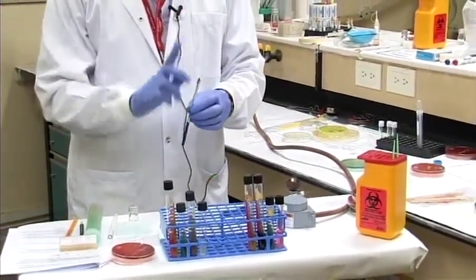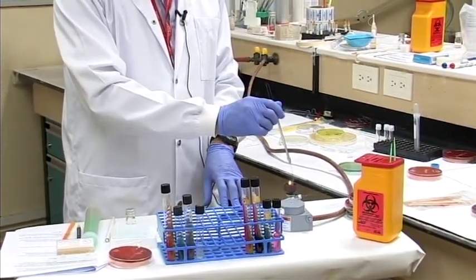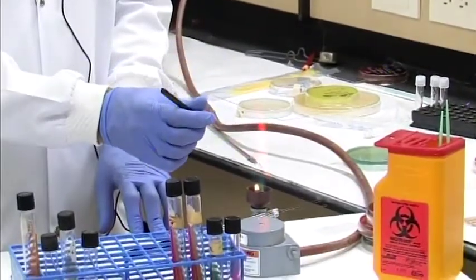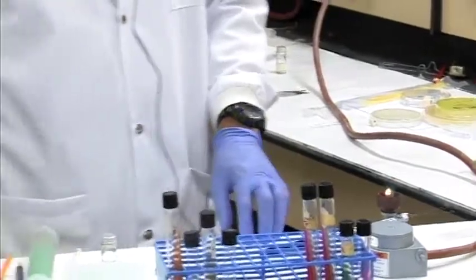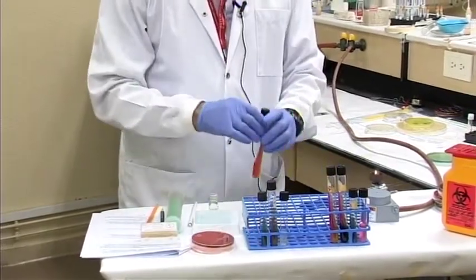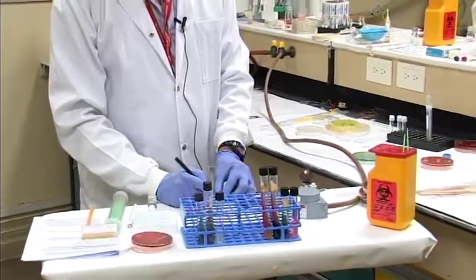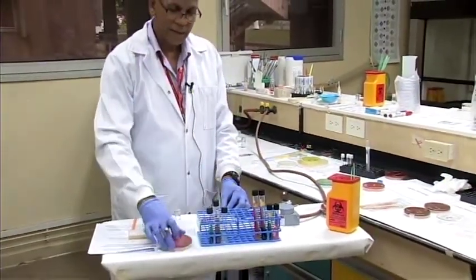This straight wire is used for inoculation. Again, you want to heat the wire before, and in this case you must heat the entire length of the wire shaft to make sure it's sterile. Within 5 seconds or so, it will cool. While that is cooling, make sure you label your tubes with the specimen type, specimen on a plate, which bacteria you're going to identify, and the date.